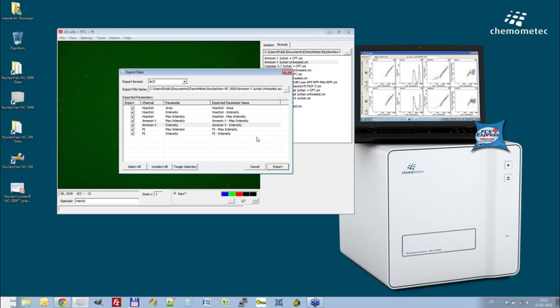And that file will bring us directly back to Sean, who can import these files and show how to use them in FCS Express. So Sean, I think I will hand this presentation back to you.